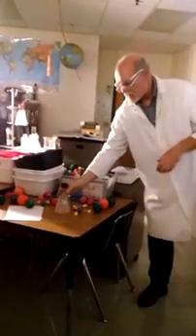All right, so a very high percentage of the gas in here is hydrogen. And we are going to give it just a little bit of energy to start this reaction right here. Doesn't take much, because once it produces water, the energy will be used to start and continue the reaction. Kind of a chain reaction. All right, so you get to ignite the hydrogen, all right? Fire.